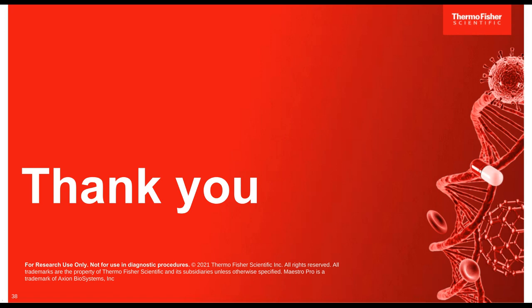Do you keep ROCK inhibitor when performing the medium change? When performing the media exchange, we only add a ROCK inhibitor on day 0 during seeding. So no ROCK inhibitor will be included when removing media and replacing with fresh media. You only need to add the ROCK inhibitor on day 0 during seeding.